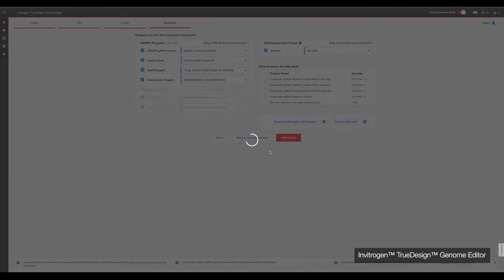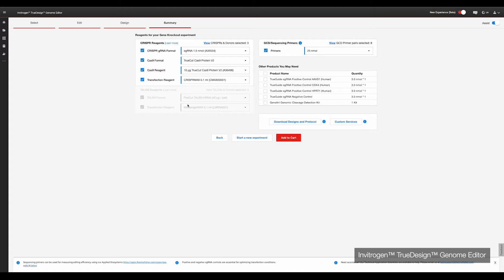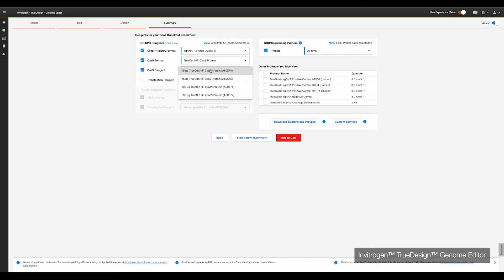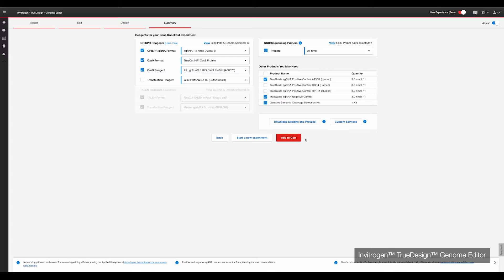Clicking Next will take you to a summary page of the reagents you will need for your experiment. Simply select or deselect what you need via the checkboxes, and use the drop-down menus to choose the amounts. The software includes the option to add positive and negative control gRNAs for your experiment — these verified gRNAs are great for optimising your experiments for a new cell type. For today's experiment, we will need gRNAs, TrueCut HiFi Cas9 protein, GCD primers, and positive and negative control gRNAs. Click the Download Designs and Protocols button for a summary document, then click the Add to Cart button and all selected reagents will be ready for ordering.